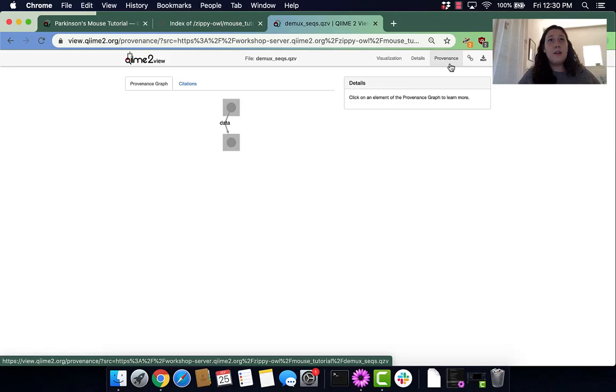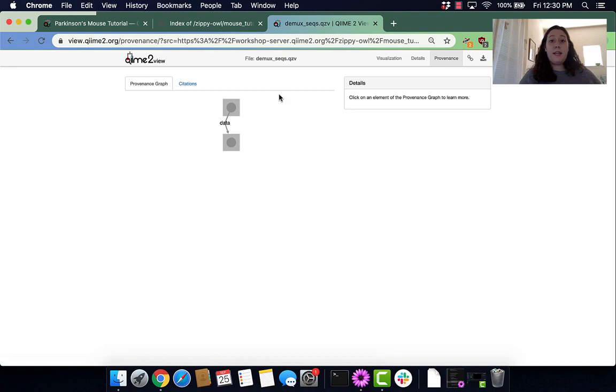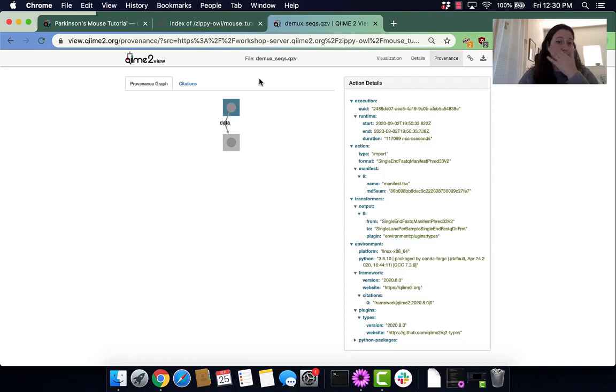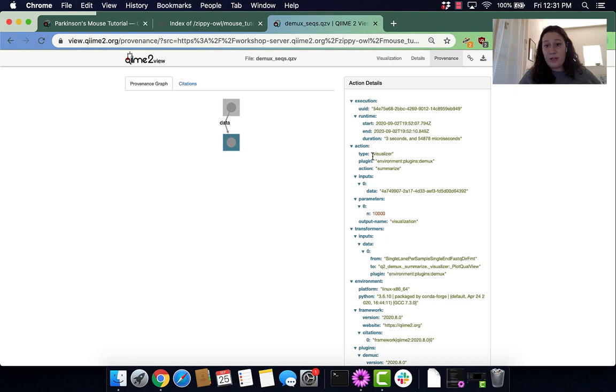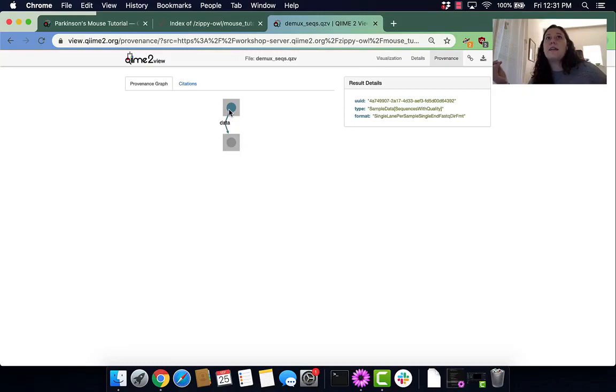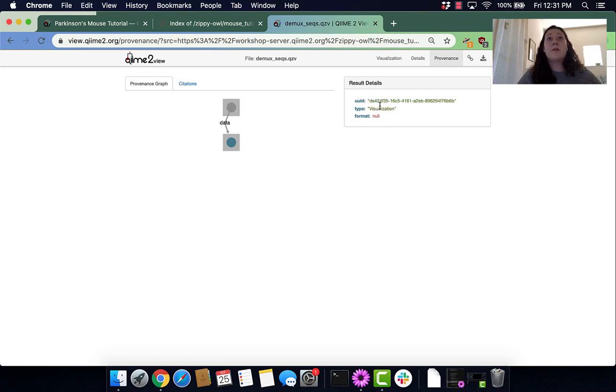Then we're going to go to Provenance. Provenance is awesome because it keeps track of a record of whatever you've done. Not very descriptive here because all we've done is import our data and visualize it. The squares tell us the actions we've done. Here we can see we imported our data through a manifest. Here we visualized our data using the action Summarize. These little dots show the result details, explaining the results we got.